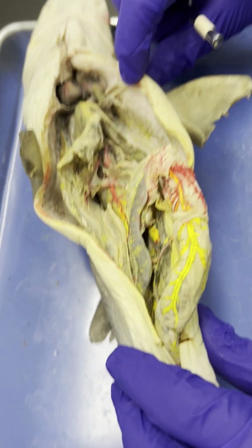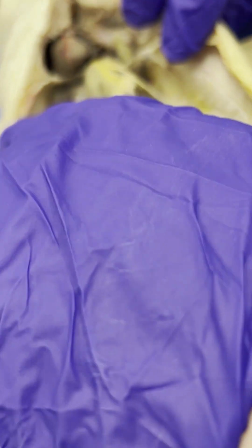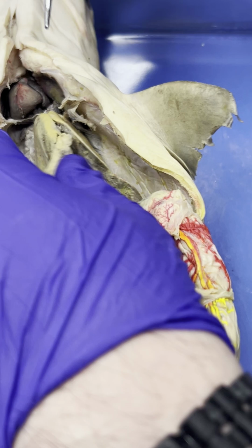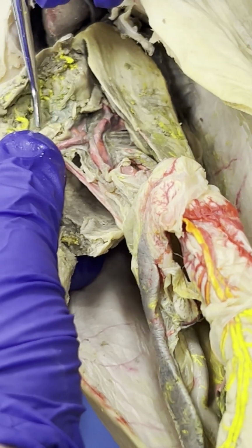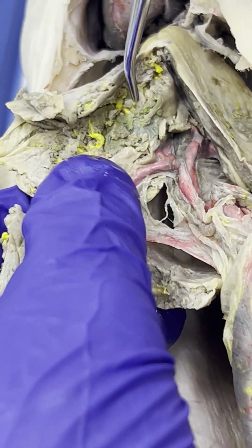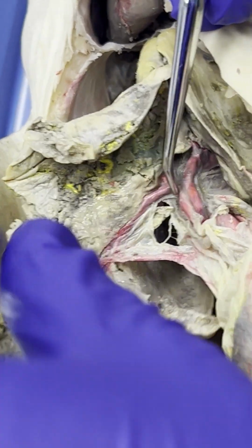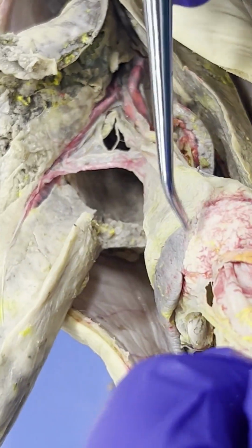All right, guys, so 2 more structures that we're going to go over today in this video. It's the common bile duct. So the common bile duct is actually connected between the gallbladder and the duodenum. So if we find our gallbladder again, remember it's a dark green structure that's attached to the median lobe of the liver. So dark green structure attached to the median lobe of the liver, which is right here. And if we actually follow the bile duct, gallbladder, bile duct, following it down, and we kind of keep following it, we're going to end up in our duodenum, which is right here.